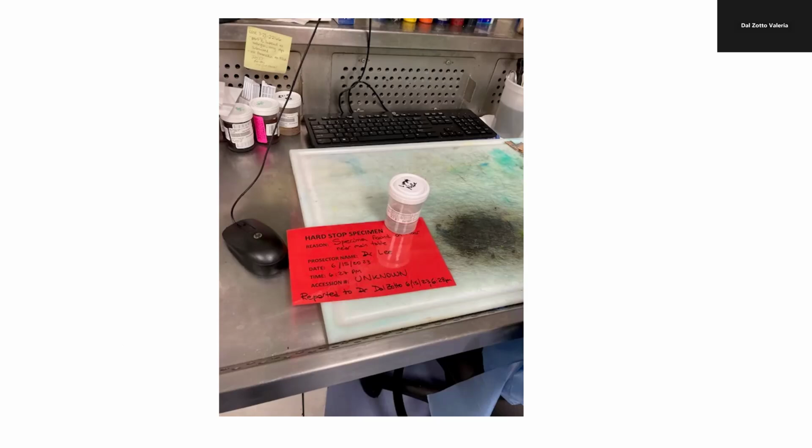When you find something that is not matching, please call someone as a witness. She went to my office and reported it, and we went together and put the specimen in formalin, with the date and the time that we collected it, and gave it to the supervisor at the gross table, and he took care of that.